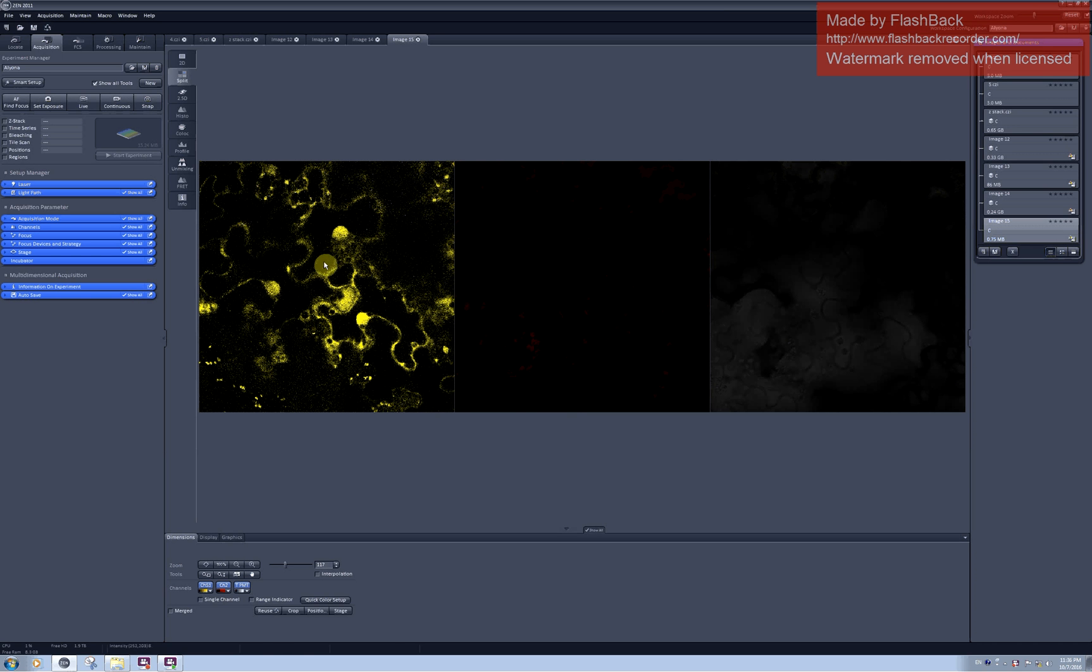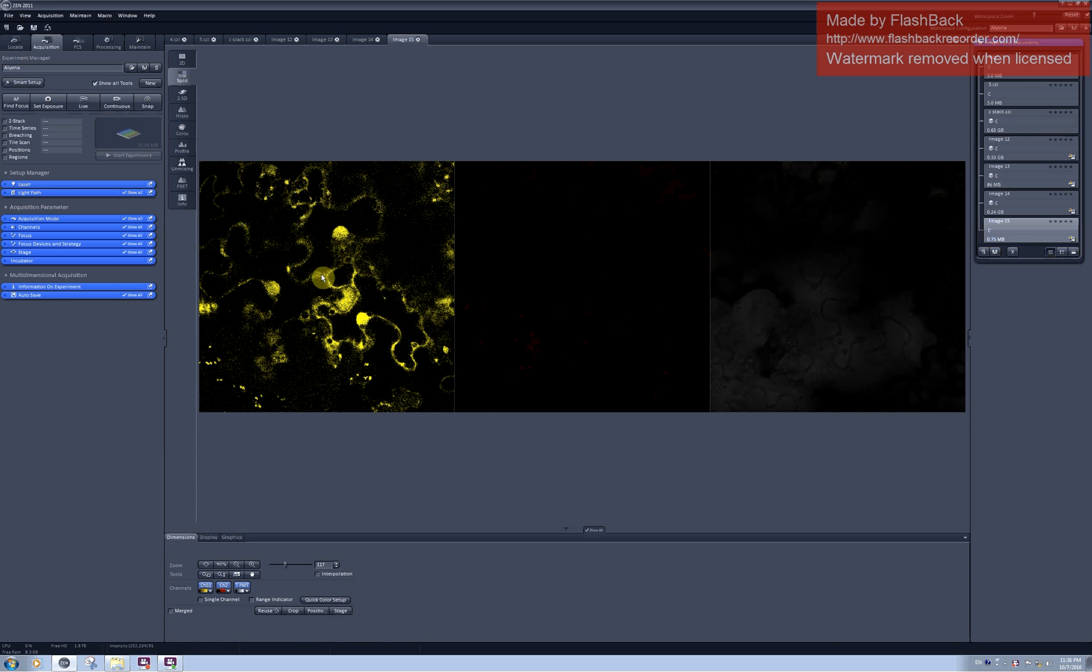Here I would like to photobleach YFP inside the nucleus and then see how fast does the still fluorescent protein from the cytoplasm diffuse into the nucleus.